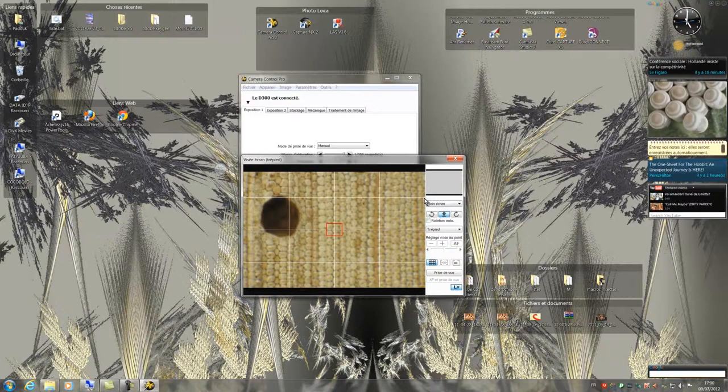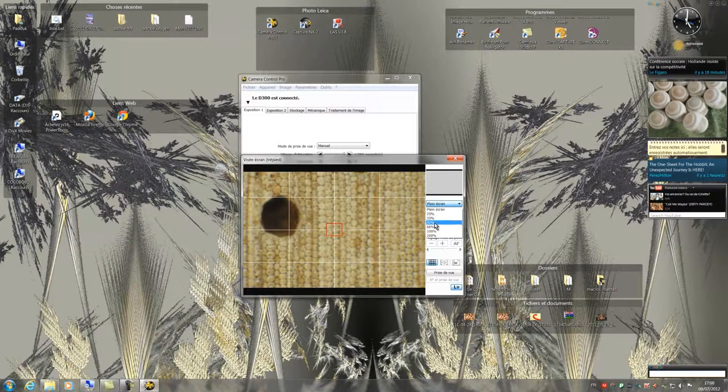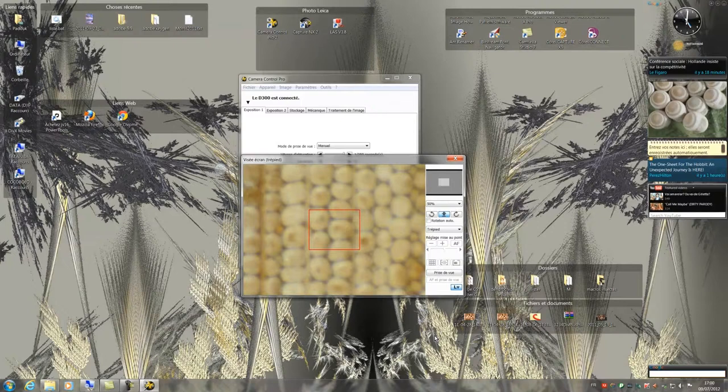By clicking here, I have the possibility to enlarge the image displayed in the window. By doing this action, I see that the focus is not perfect.